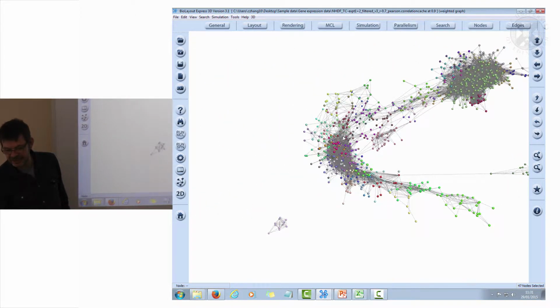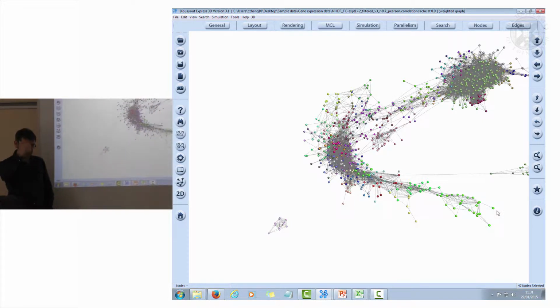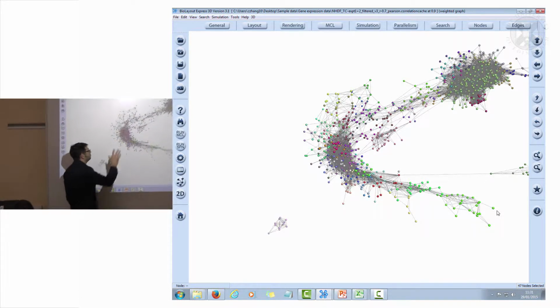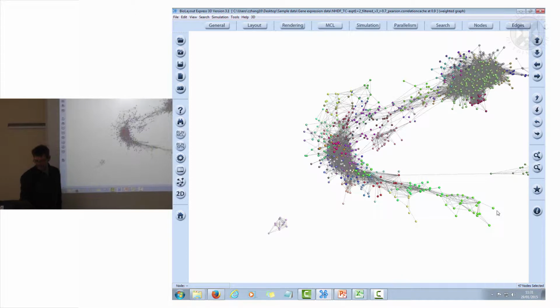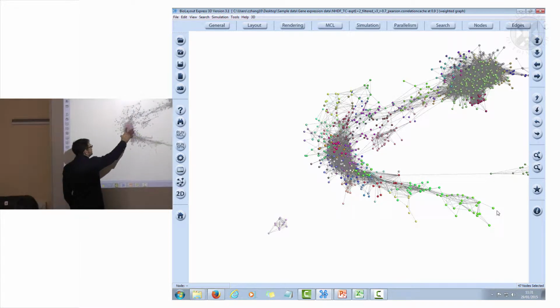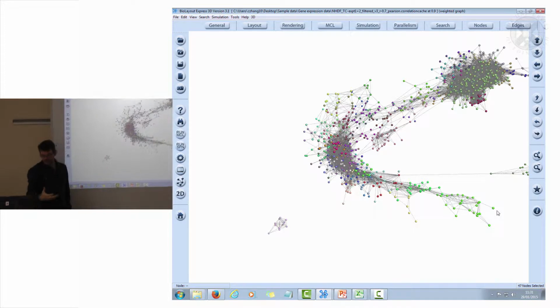Then you get into this phase here, which is G1. These are all the genes which are upregulated as cells grow and prepare to go under division. So you're looking here at a lot of growth factors, a lot of metabolism upregulated here, and essentially this is the growth phase, and these will get turned off.